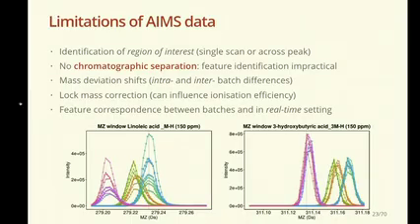So some challenges, as we discussed: which region of interest should we focus on in the chromatographic sphere? It's easier, you will at least have multiple chromatographic peaks. Of course, multiple compounds can elute at the same time, but here, single scan, multiple scans. As we will discuss in much more detail, the lack of chromatographic separation and the simultaneous introduction of all of the isotopic species, all of the adducts, and just all of the ions really makes feature identification very impractical, and there's a lot of effort needed to correct for it.